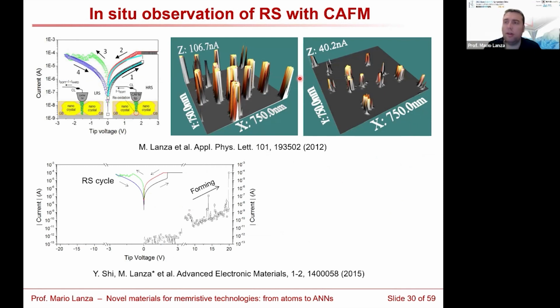So I am more a fan of the maps, because you don't need to go to such high currents in order to induce the resistive switching, because with the maps you can catch the weakest locations. With the IV curves it's more difficult to catch the weakest locations, but with the map it's better. So I will say if you want to see better reproducibility, use maps. Don't put the tip in one specific place. Using maps probably is going to be better.